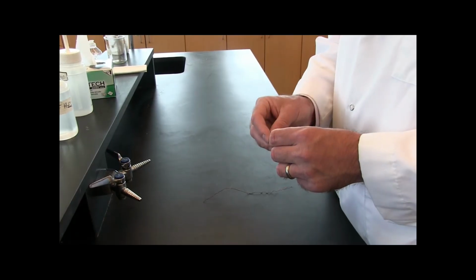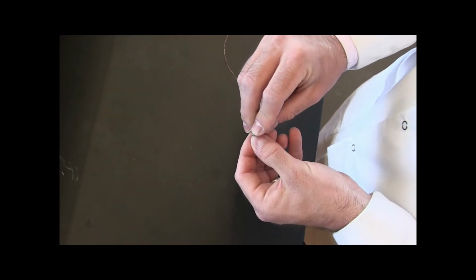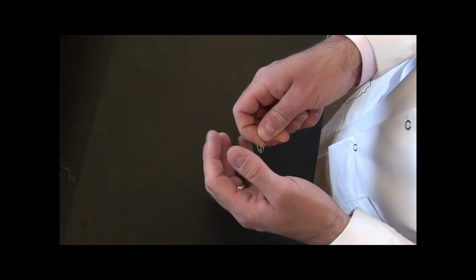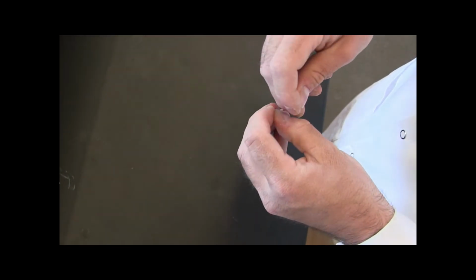So here we go. Mr. Falk is filling in for Taz today. Here he rolls the magnesium into a spiral. And now he is threading the copper wire through the magnesium and wrapping it around to make a cage.